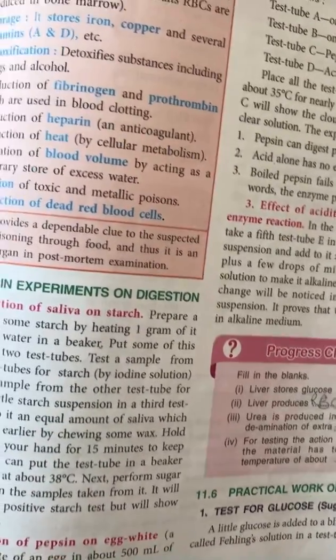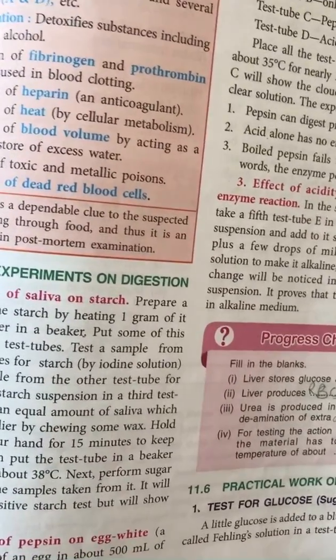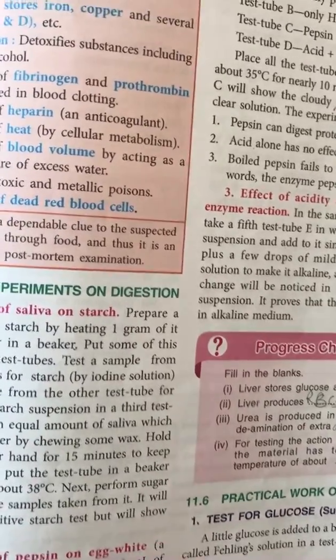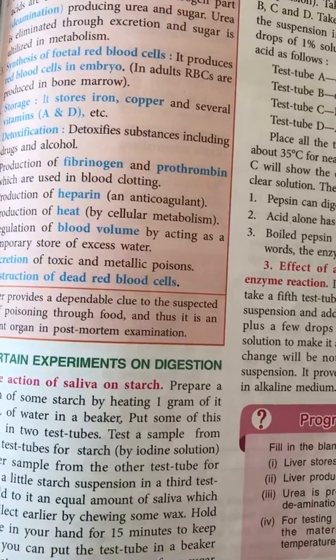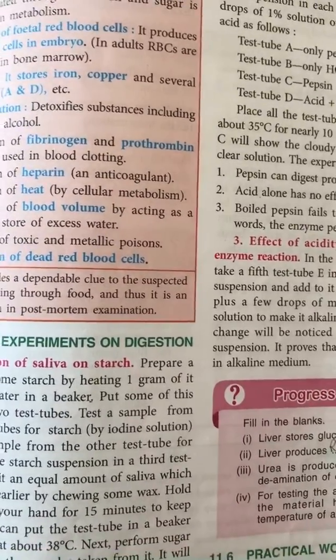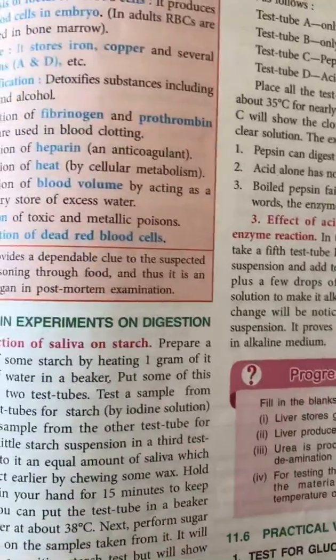And now you perform the sugar and starch test on it. You will see that it does not show a positive starch test, but the sugar test is positive. This shows that the starch which was present has been converted into simple sugar.